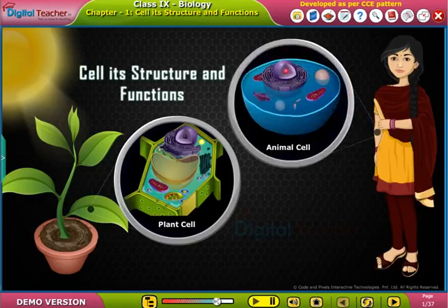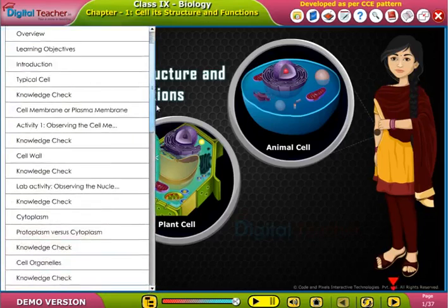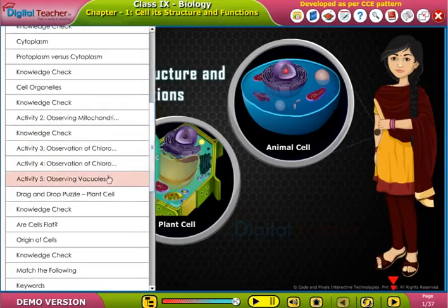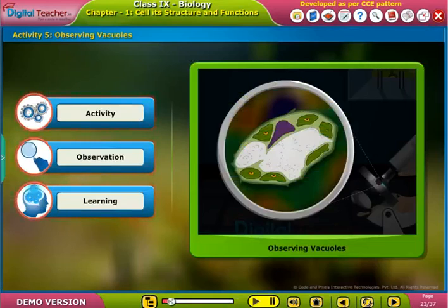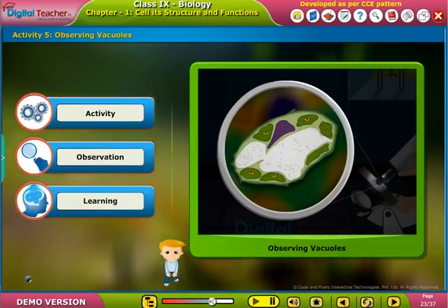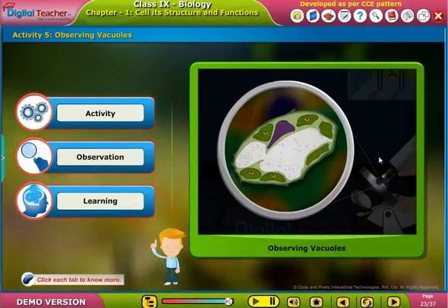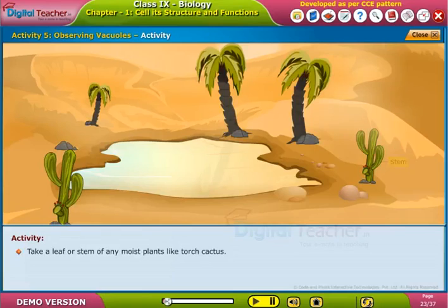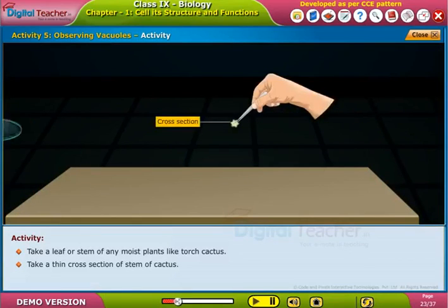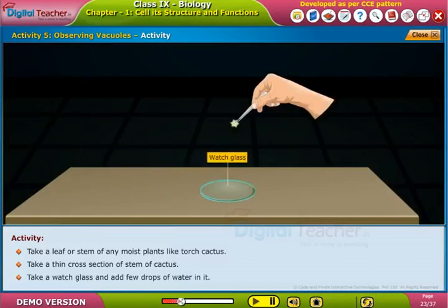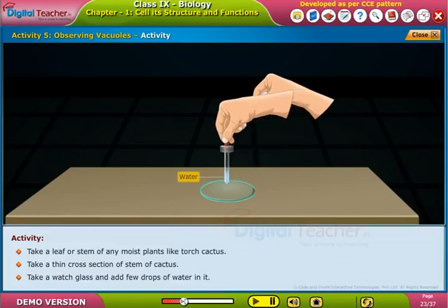Welcome to the chapter on cell structure and functions. Here, let us perform an activity to observe the vacuoles in a cactus leaf. Click each tab to know more. Take a leaf or stem of any moist plant like torch cactus. Take a thin cross-section of the stem of cactus, then take a watch glass and add a few drops of water in it.